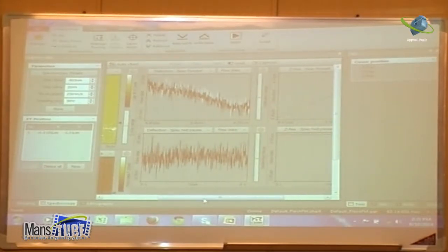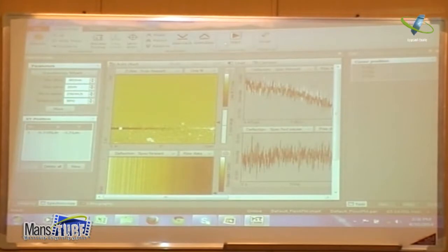If I didn't choose any one, would it calculate for everyone? Or do you have to choose whether you want to make 1 point, 10 points, or 100 points, and then it gives you the value? I asked the question because the start button is active. Yeah, when I click this, I'm measuring the point in the center of the image. Okay, 1 point in the center of the image.